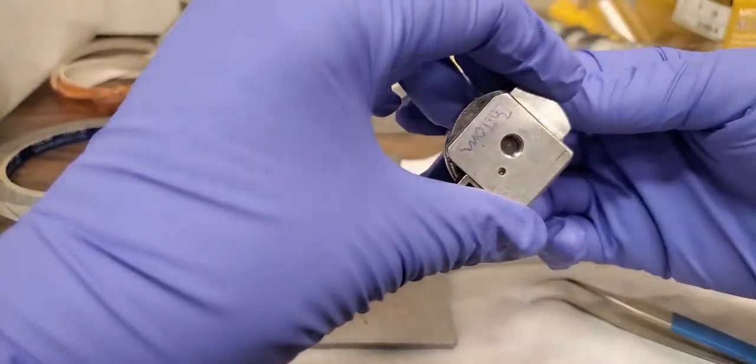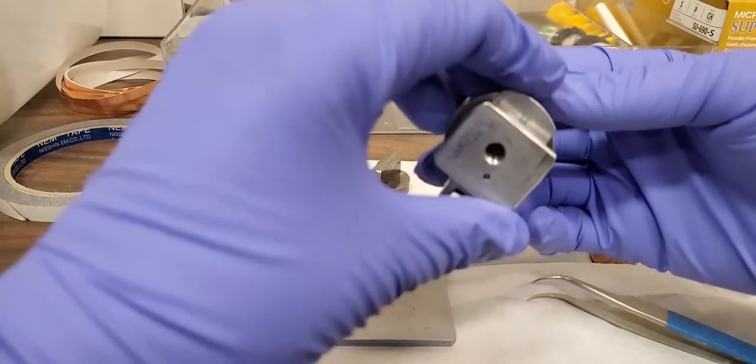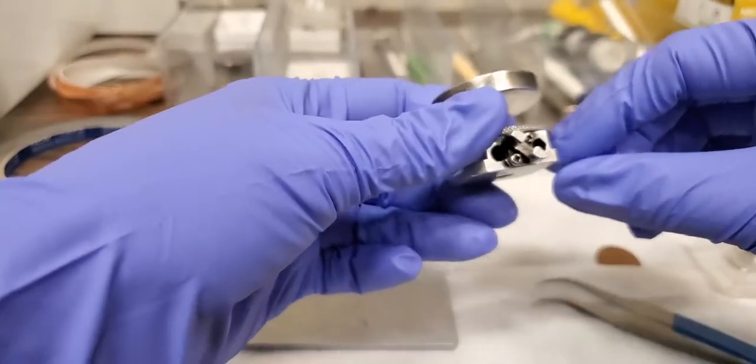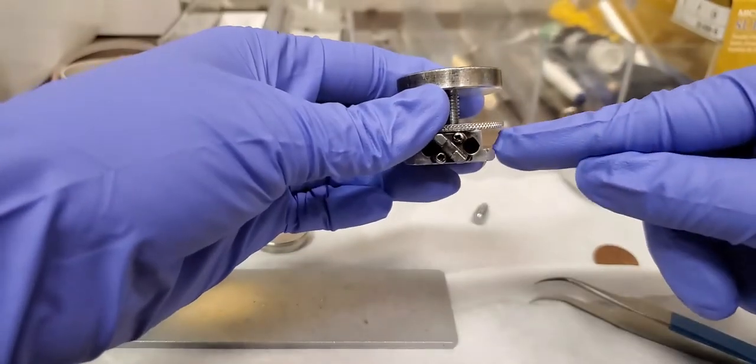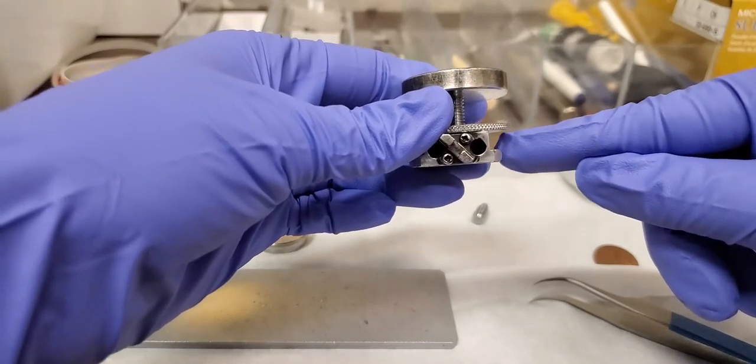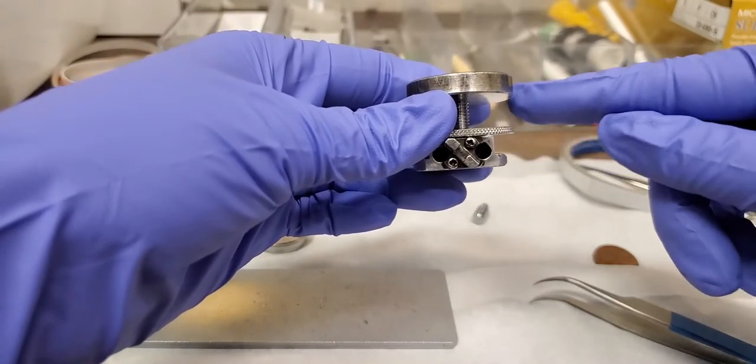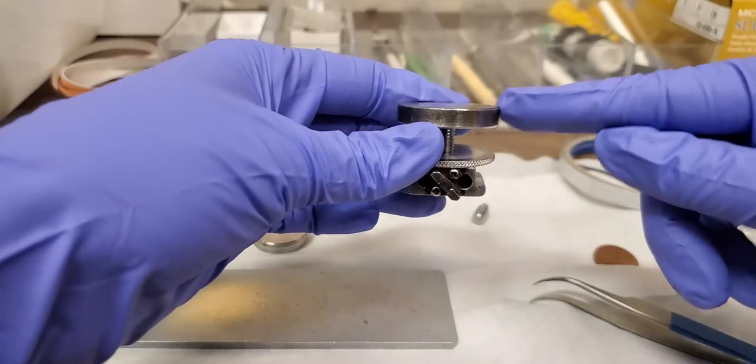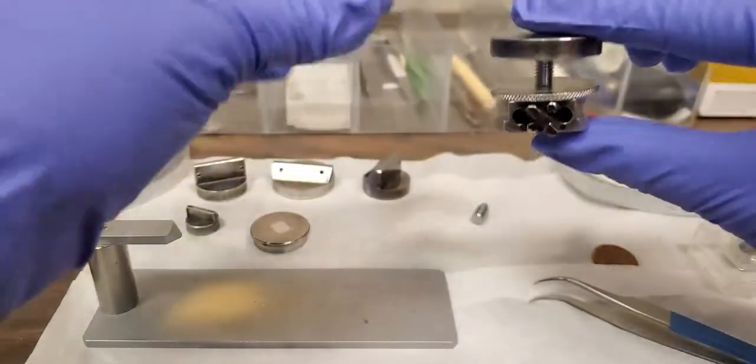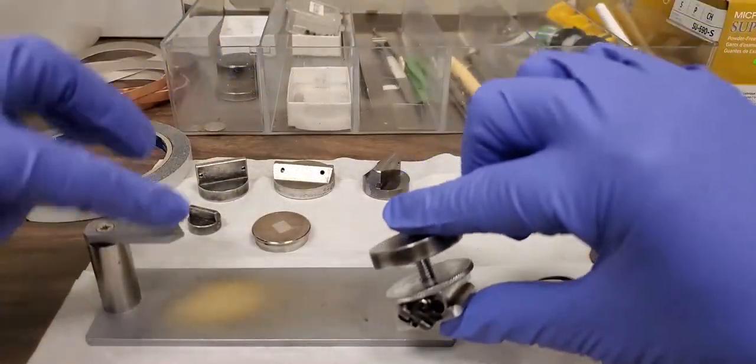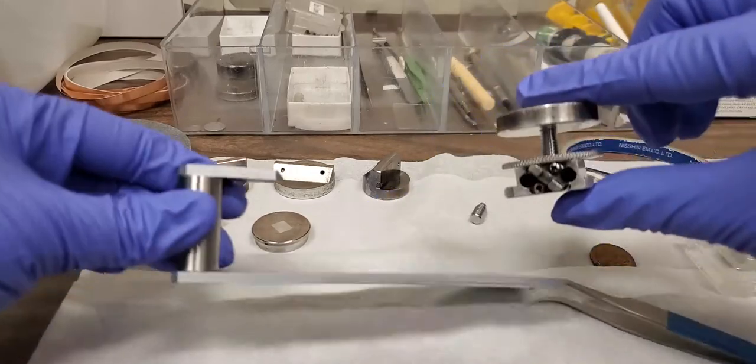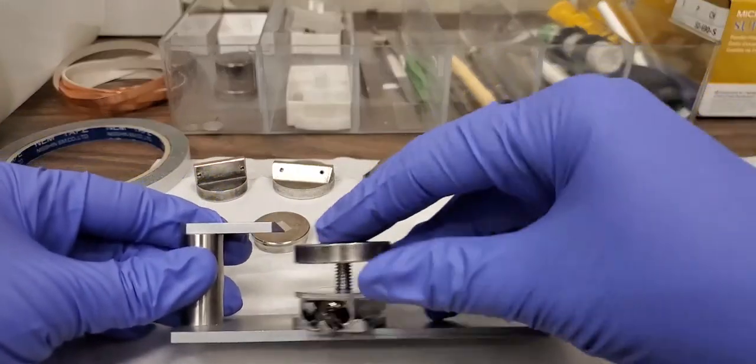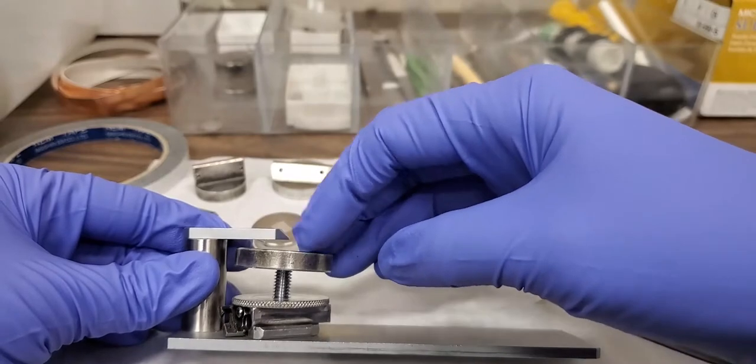And you can see this is the bottom. This side should be pointed down. Then you have the washer, screw, and the sample plate. Now we need to figure out what's the height. This is our height gauge.